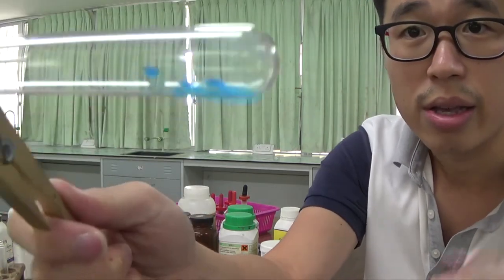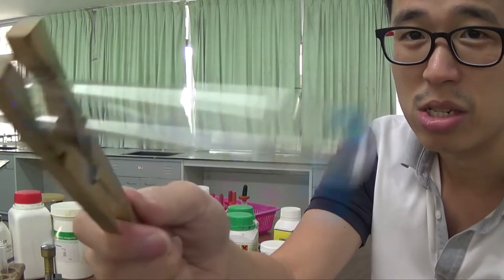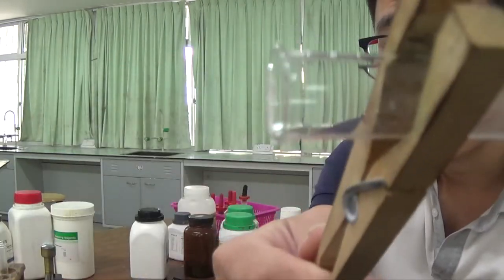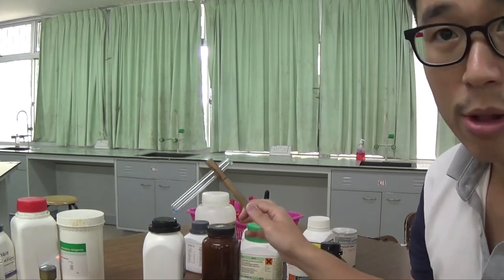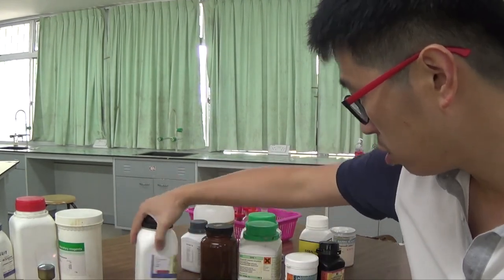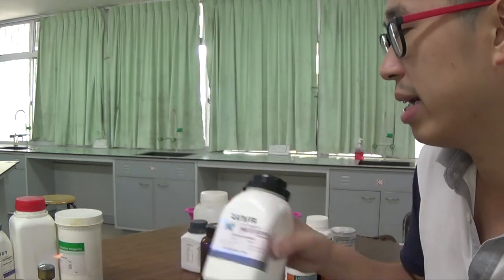You can hear the sound. It doesn't stick on the walls of the tube because it's dry. When your test tube is dry, it should not have any solids stuck on the side at all. The upper part is dry, the lower part is dry. Okay. This was copper 2 sulfate with 5 water of crystallization, which of course you know how to calculate the molecular mass already. That was one of the earlier exercises.